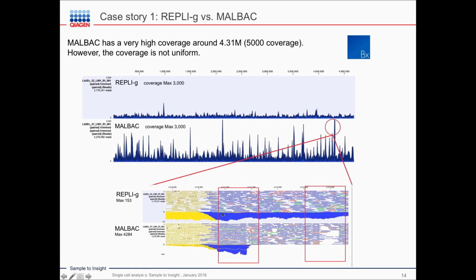And here we've zoomed in a little bit, so you can see in the overflow region that you have much more even coverage. Here you don't even have any of the overflow coverage in this region of the genome, so it's much less than you have here. You might be curious about why we have these yellow reads here. Those are reads that have the potential to map in other locations in the genome, so those are just flagged as part of our information about the read mapping.